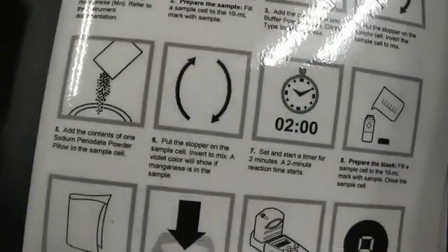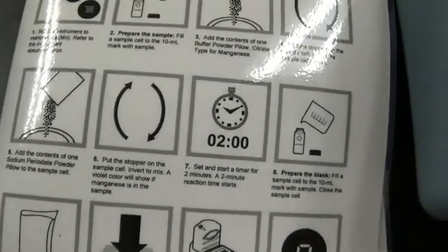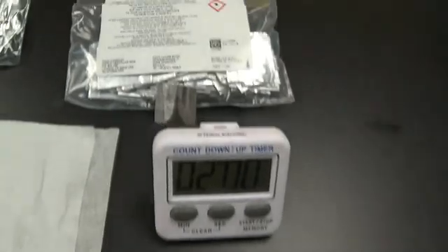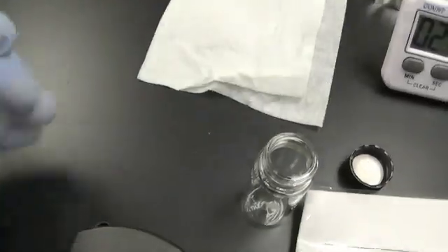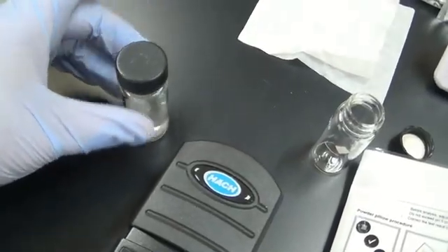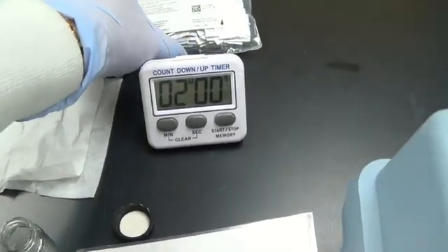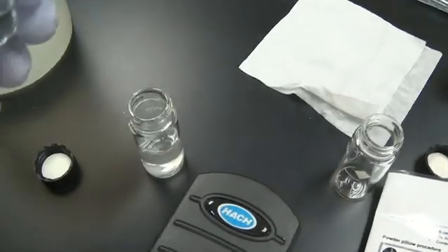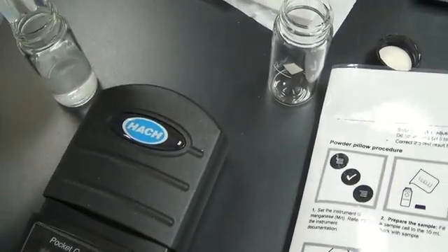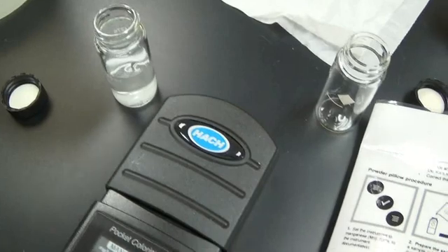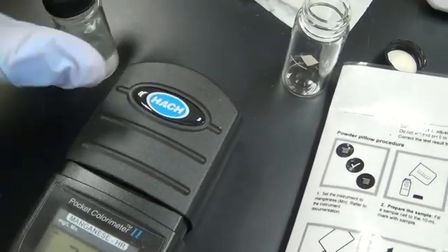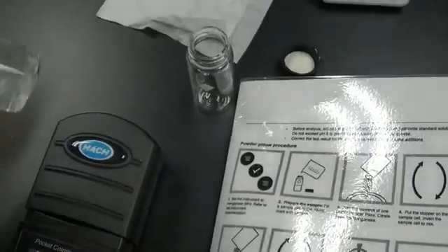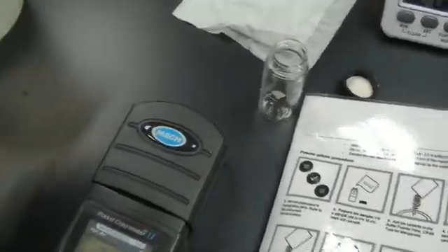Next, I add the contents of one sodium periodate powder pillow to the sample. So I have that right there. Cap it. Next, invert to mix. A violet color will show if manganese is in the sample.